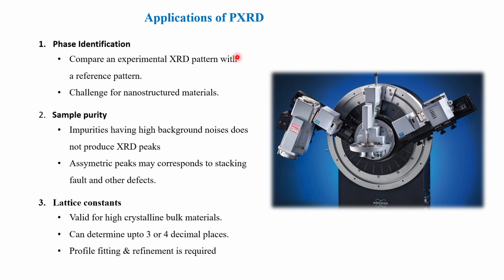The third is the lattice constants. Lattice constant determination is valid only for highly crystalline bulk materials. We can determine lattice constant values up to 3 to 4 decimal places. For that, profile fitting and refinement is required, like Rietveld refinement, to accurately determine the lattice constants.